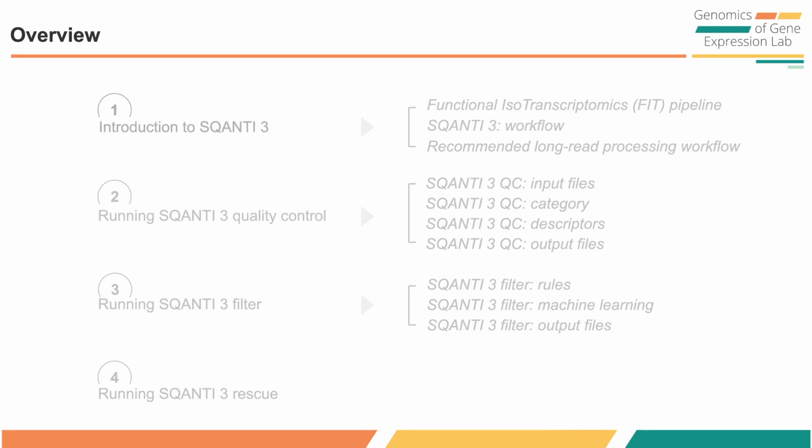The first part is an overview of SQANTI3, briefly introducing the functional isotranscriptomics pipeline. We'll also give you a summary of how SQANTI3 works and introduce the recommended long-read processing workflow before SQANTI3.